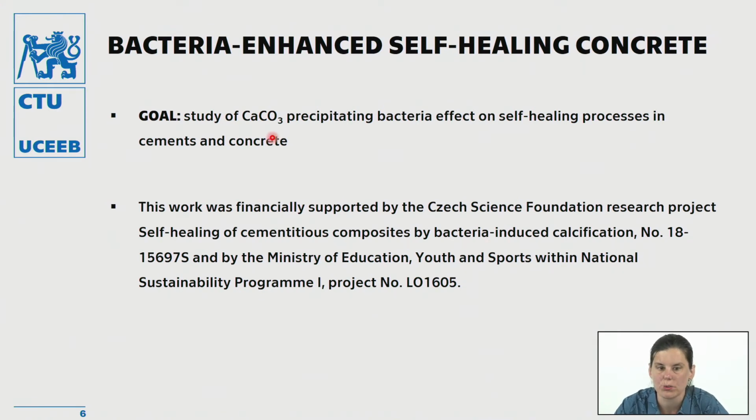He and his colleagues want to investigate the effect of calcite precipitating bacteria on the quality of the cement pastes.